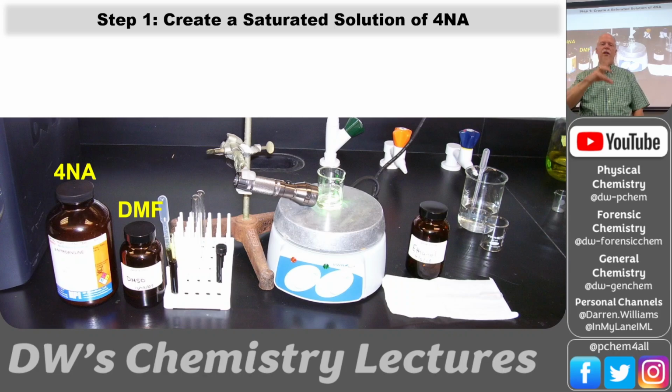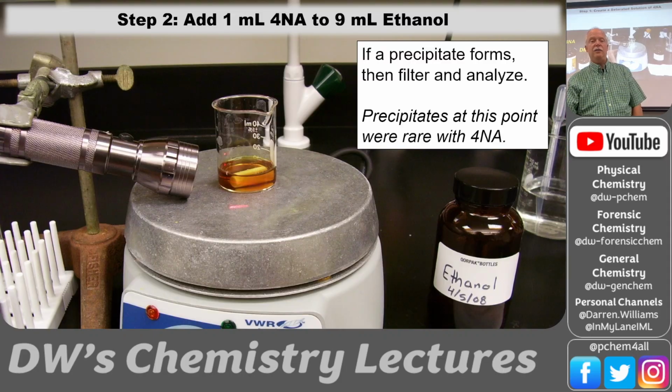And then we took 1 drop of that, or I think it was 1 mil actually, 1 mil to 9. And then we took 1 mil of that solution and dropped it into 9 mils of water, and we saw an immediate precipitate, and then we filtered that. And this is the work that the students did.